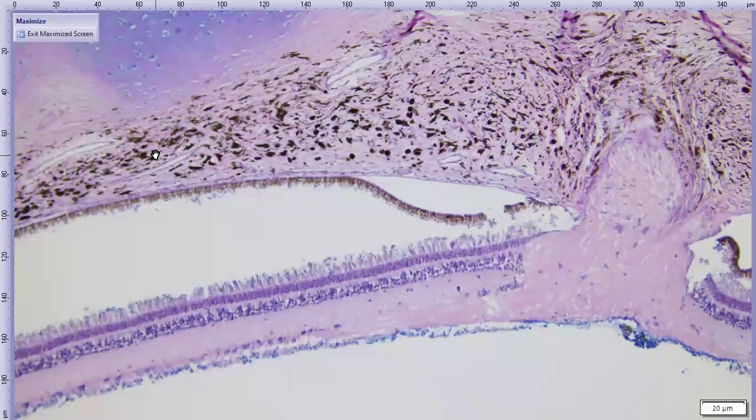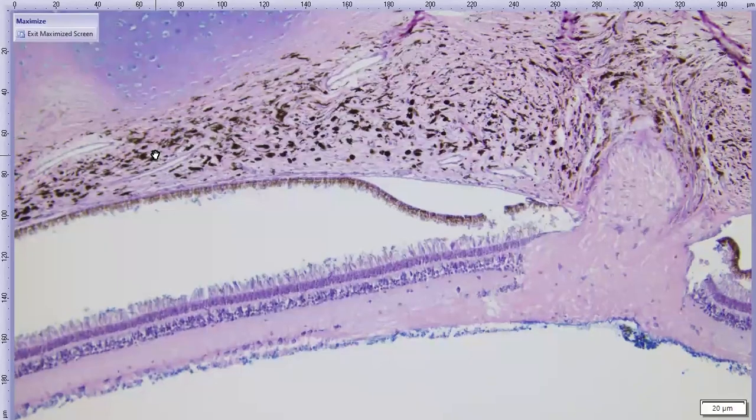There's no annular pad in the lens. There's smooth muscle and not skeletal muscle. There's no conus papillaris or pecten. So I think one can guess that, yes, those functions have been lost.